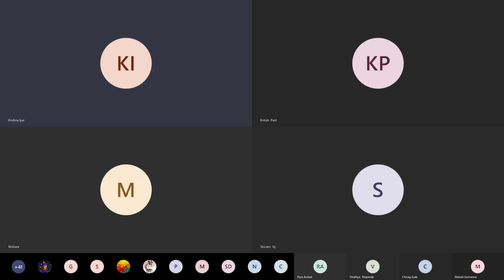And NaOH doesn't do anything to that gel. And then after separation, you actually neutralize. After you neutralize, you again add a little bit of buffer, which is basic, and then add phosphatase. That removes the end phosphate, and then again you make it neutral, and then add your kinase, and then you put that tag of P32. In both methods we talked about controlling the amount of enzymes.